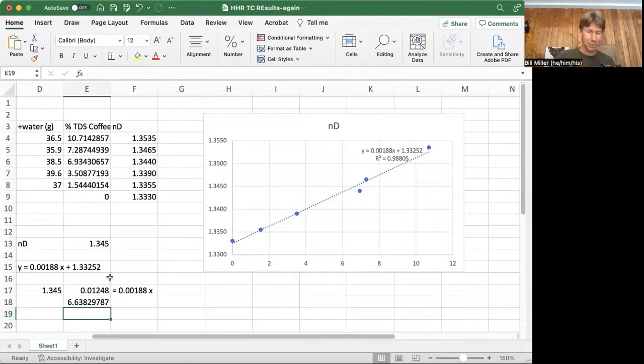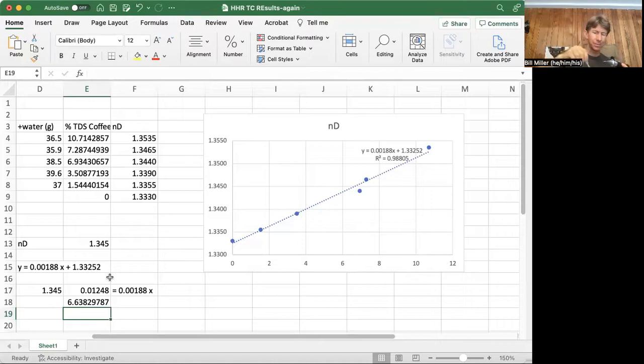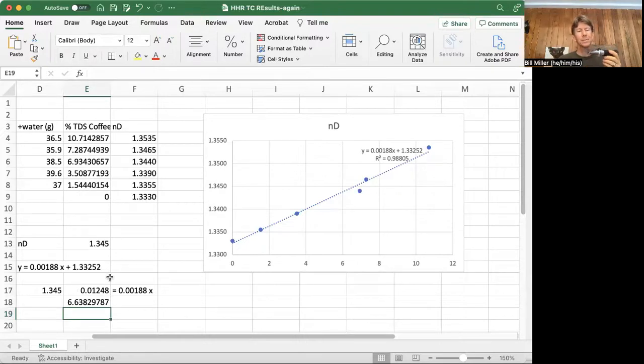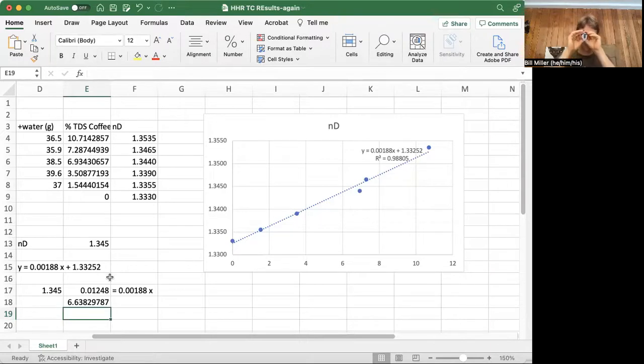I think I wrote it down. I know what happened, but I'm going to do it again anyway. One, two, three. I'm watching the drops go down to the bottom. And again, there still is an air bubble.